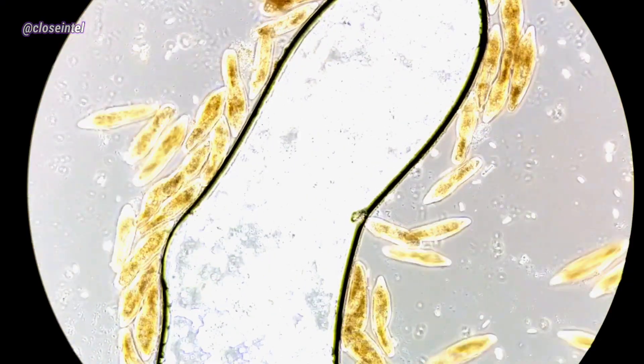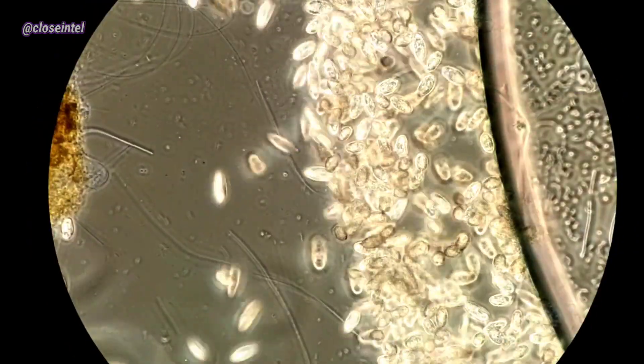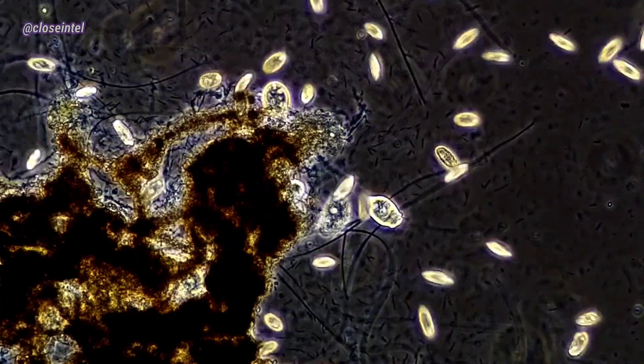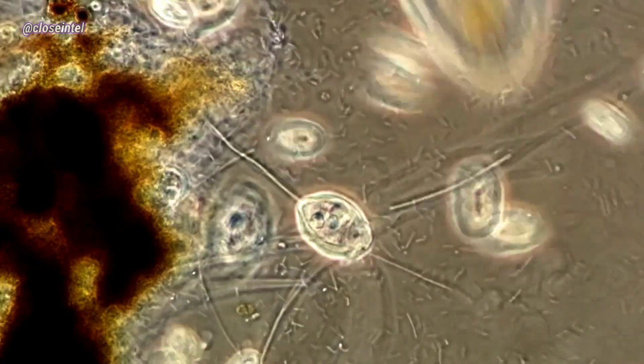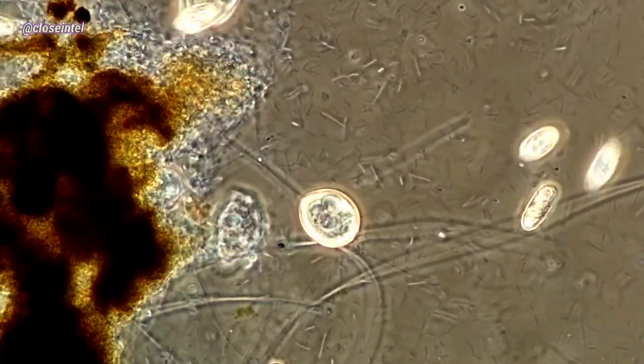As you can see here there's a ton of paramecium and there's also some other smaller cilia in the background. I'm not sure what these smaller cells are but there's tons of them. There's also some vorticella and tons of bacteria. The little tiny rod and spiral shapes that you see floating around the screen are actually the bacteria and there's a very high concentration of it in this sample.